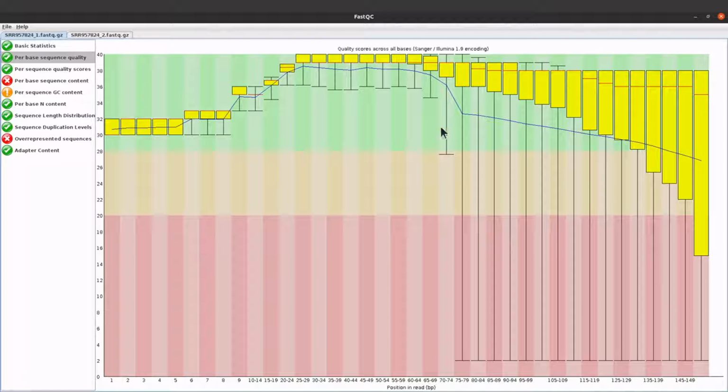So here you can see that some of the bases, the quality is very low. You can see them moving to this side here. This is to be expected with Illumina reads. So sometimes if you see them, you shouldn't be surprised because Illumina reads sometimes have some of their reads, especially those at the ends, having low quality. So that is a feature of Illumina reads.